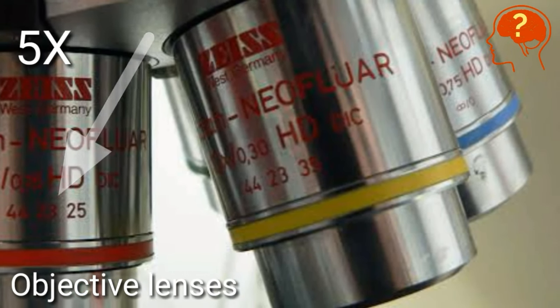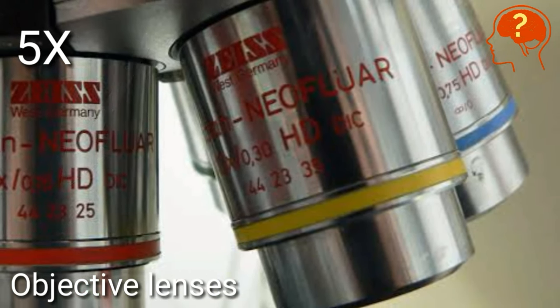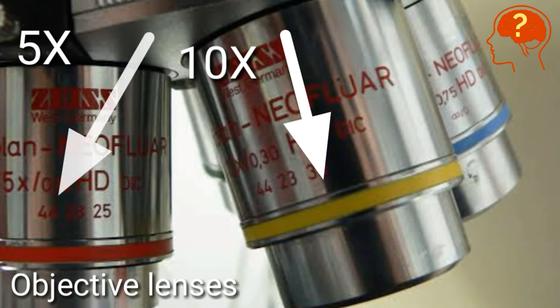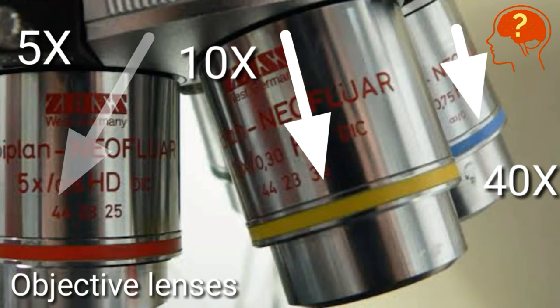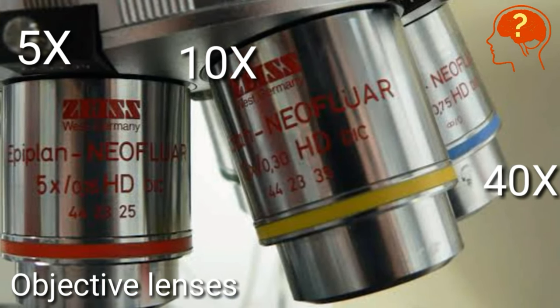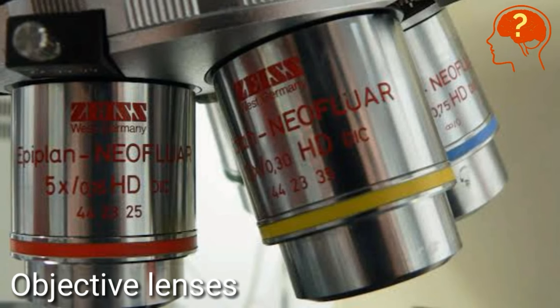The objective lens having red line is 5x, objective lens having yellow line is 10x, and that having blue or green line is 40x. 5x means it will magnify the original size of the specimen.